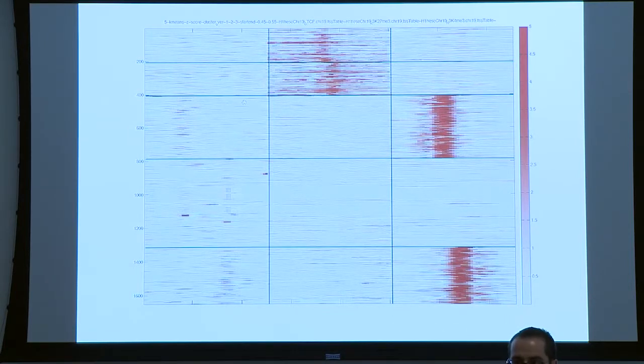So how do you identify what gene you're looking at? You can later on go to the file and say, okay, which genes they were. But it's one way to explore your data, to say, okay, I want to look at all 1,500 promoters, or all 150,000 enhancers. And then you can go back and ask, what's the genomic location within them?